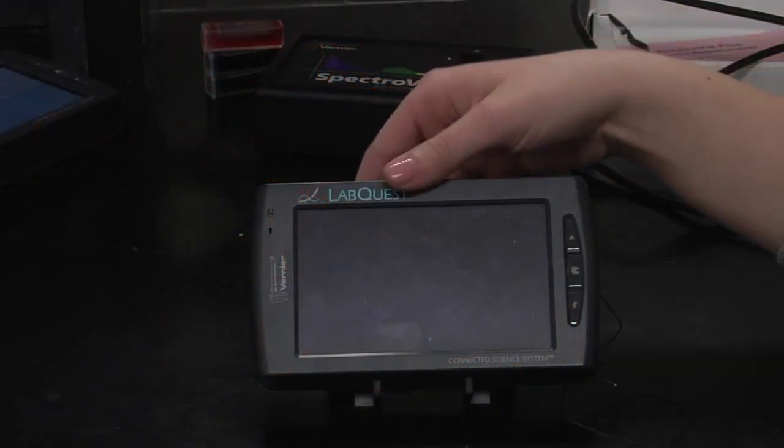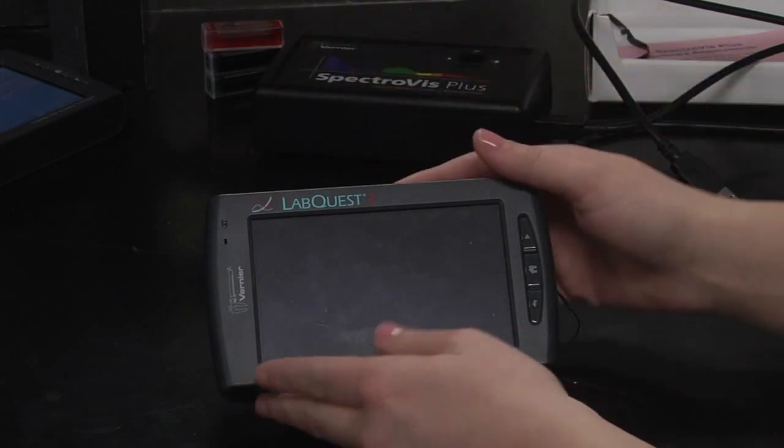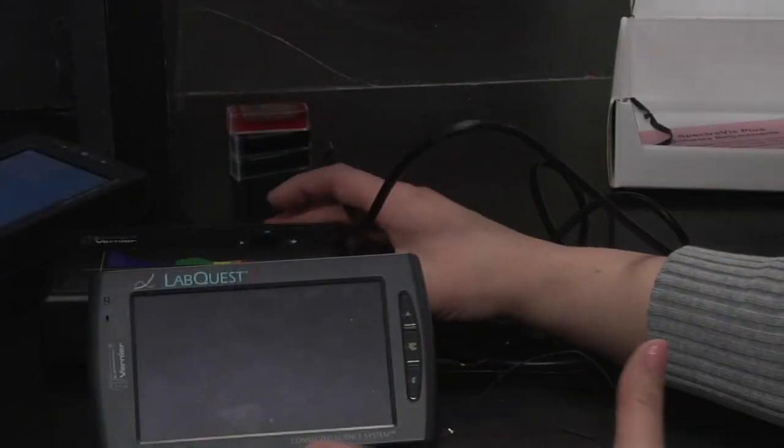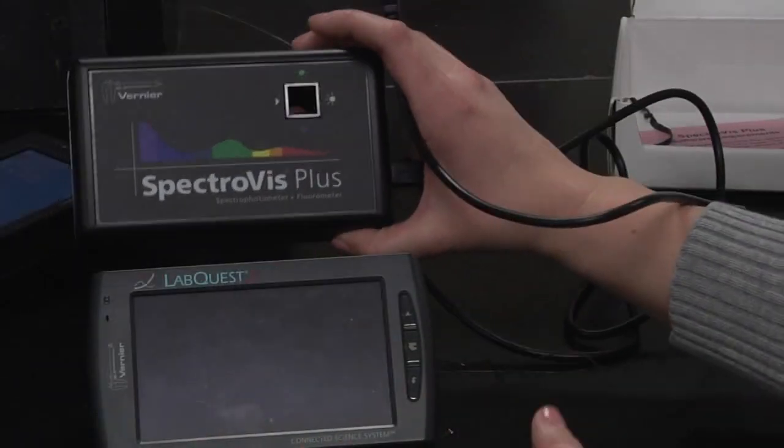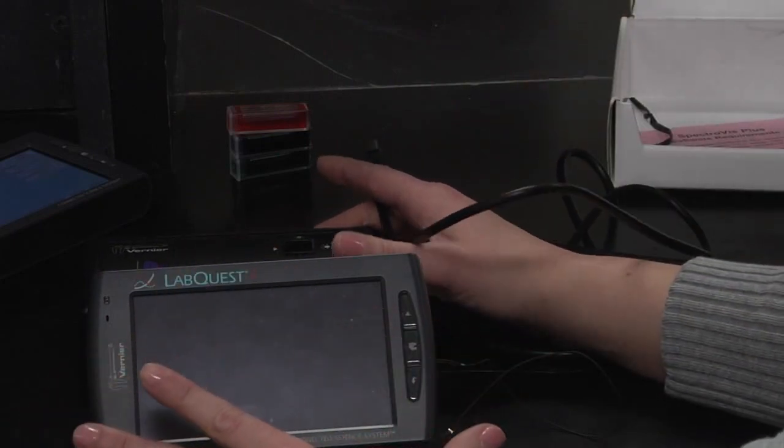Okay, so this is your LabQuest 2. You'll be using this to take all of your measurements today. To turn it on, there's a button up here on the top. Press that, but first you want to make sure your SpectroVis is plugged into your LabQuest, because without it your LabQuest won't know what to measure.